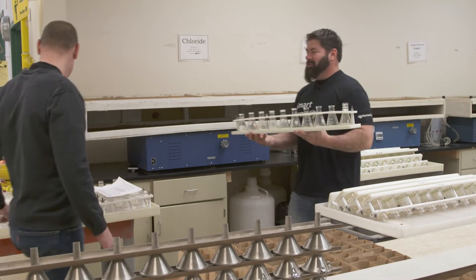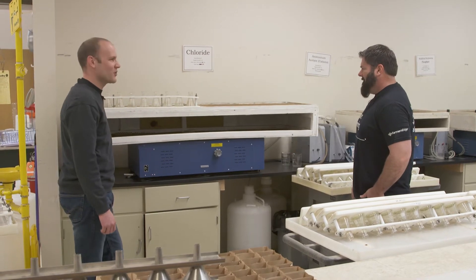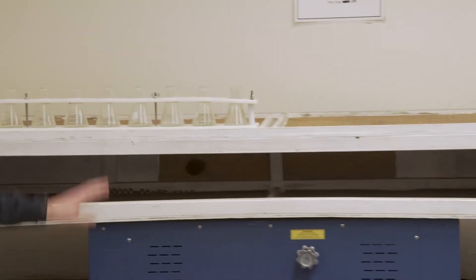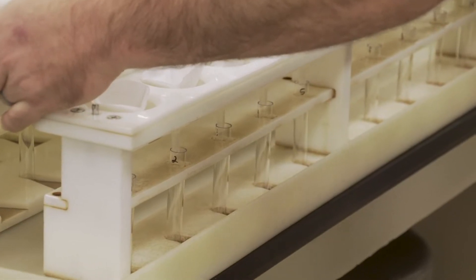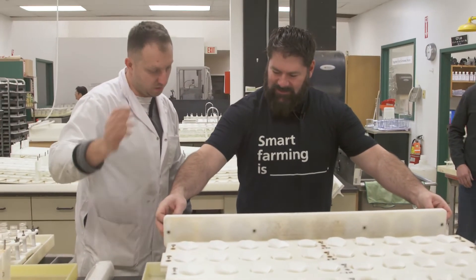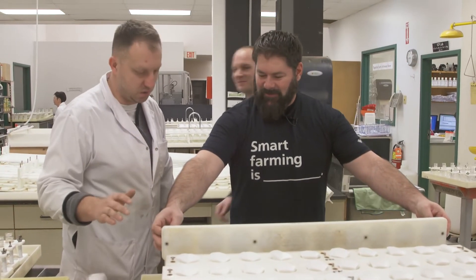The shaker will take 200 samples and they will shake for half an hour, and then they're ready for filtration. Next step is we're going to filter off the samples. You line it, and then just flip the whole thing — it won't spill over. It shouldn't, if you're a good technician.